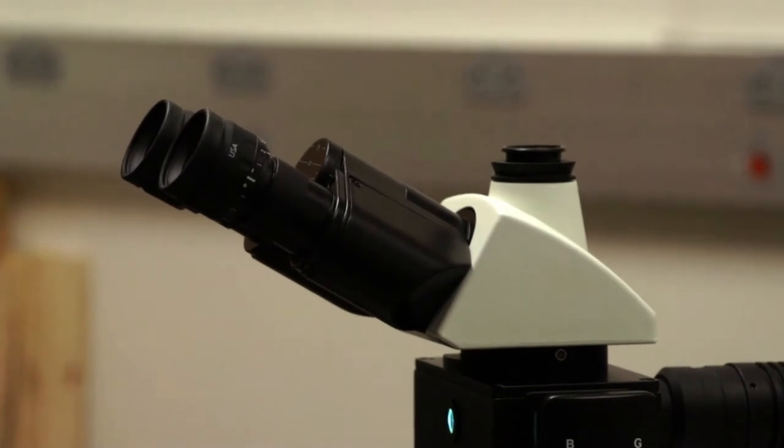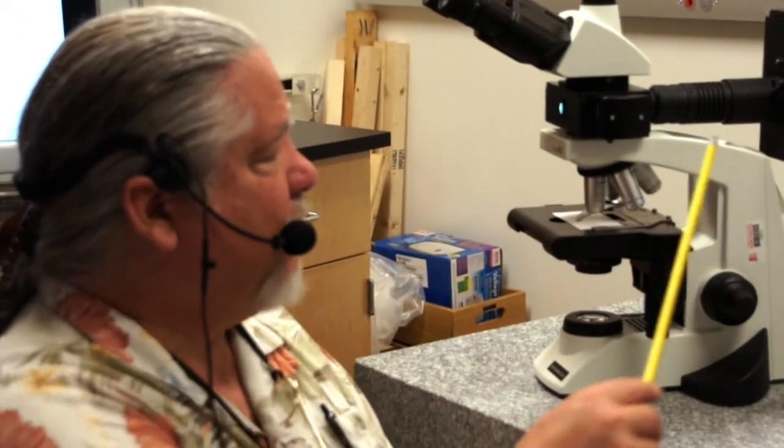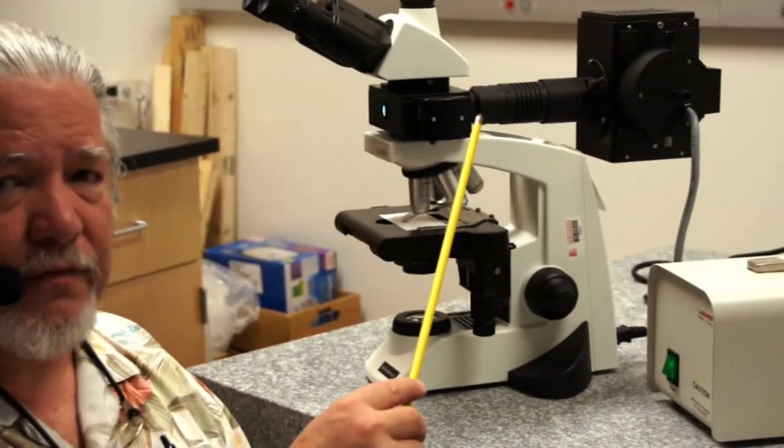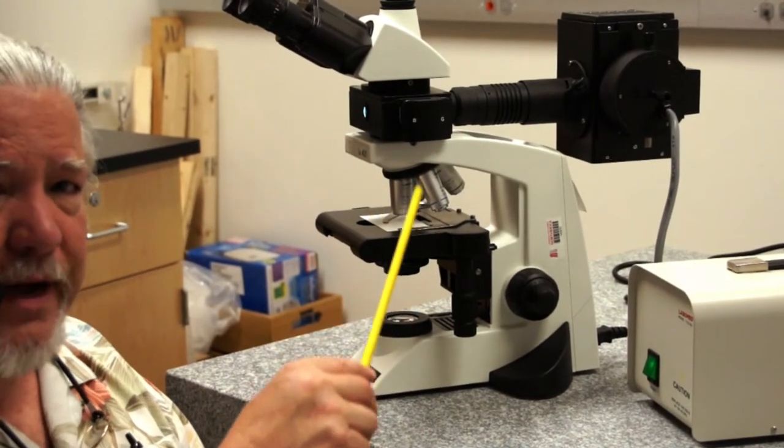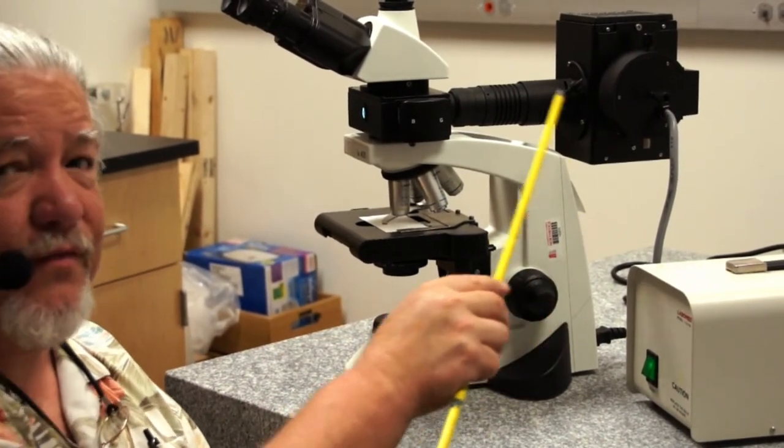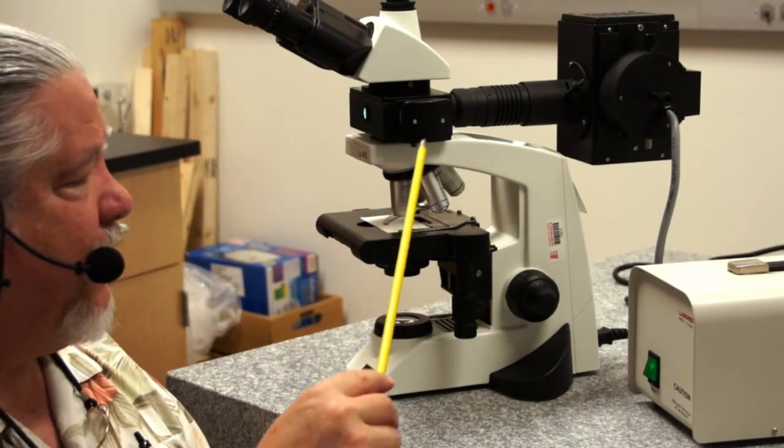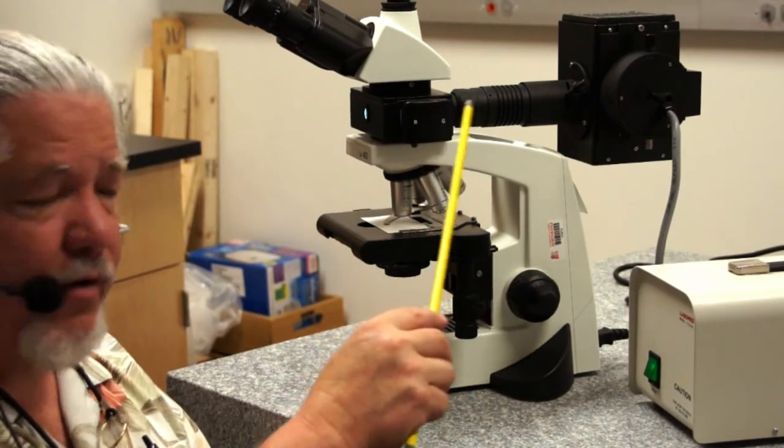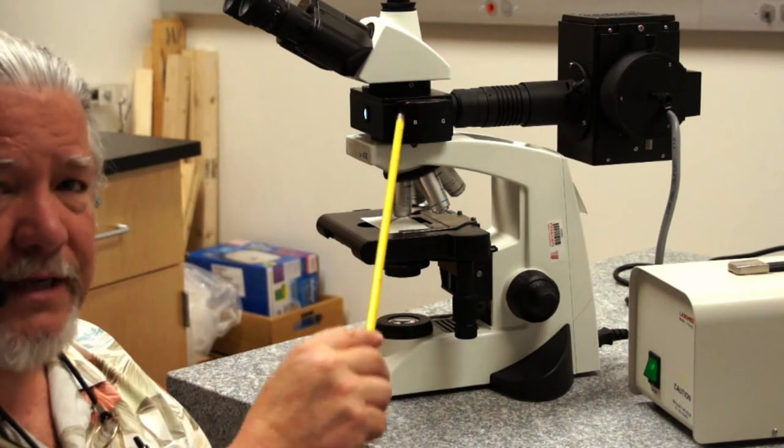We also want to discuss the illumination coming from above. We have transmitted light illumination through the microscope and we also have reflected light illumination. In fluorescence microscopy, we use reflected light illumination.